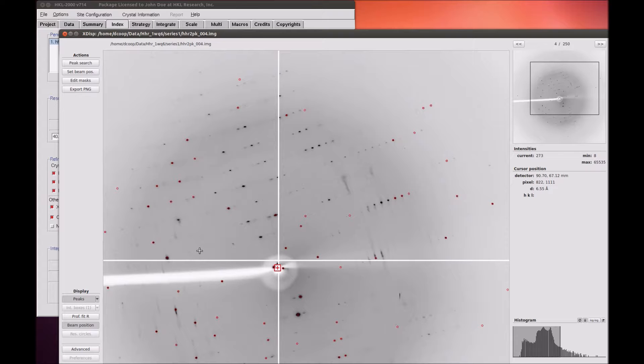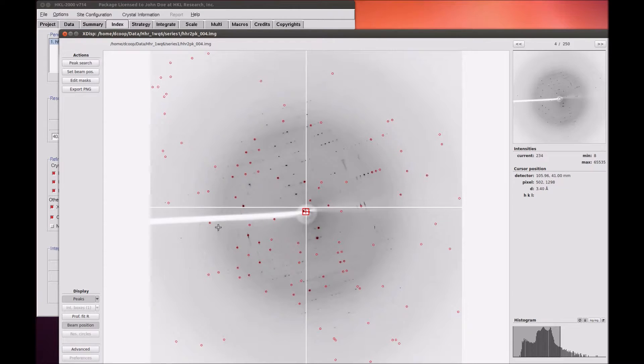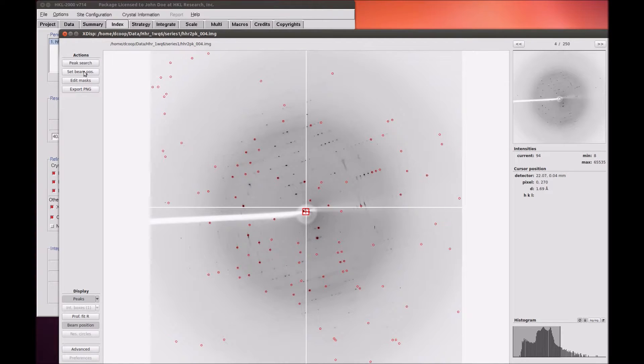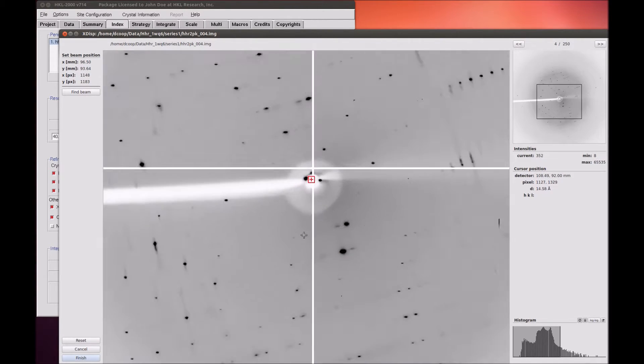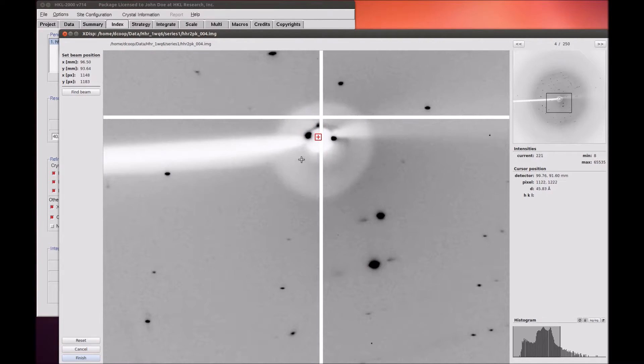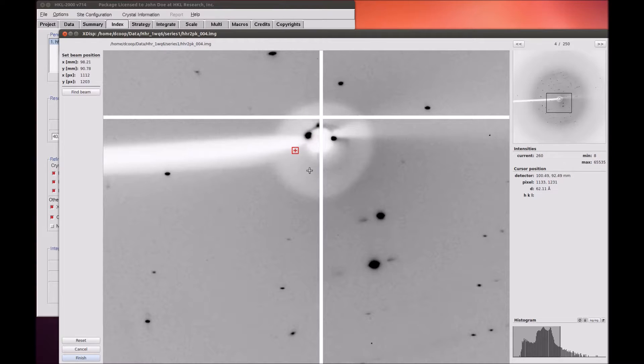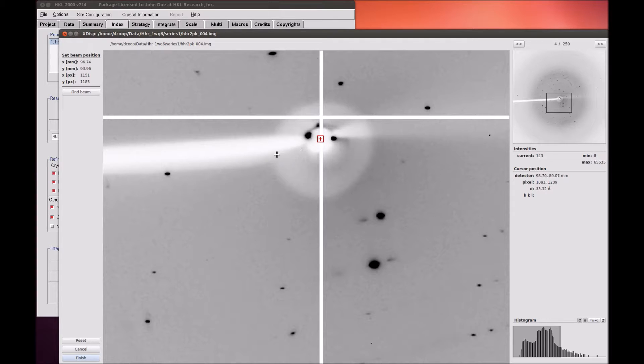XDISP QT also allows you to change the beam position using the Set Beam Position button. You can either drag the beam center to a new position, or click where you want the beam center to be. This is especially useful if you have collected data at a beam line where the beam center is visible through the beam stop.